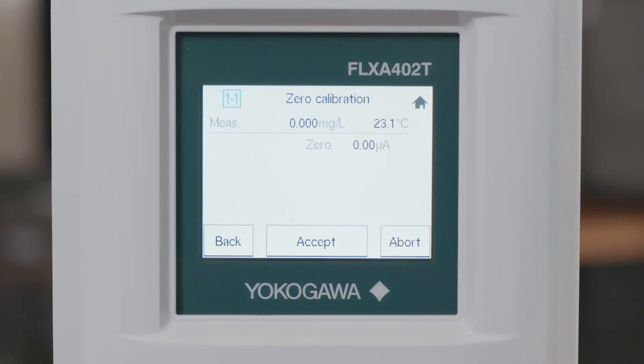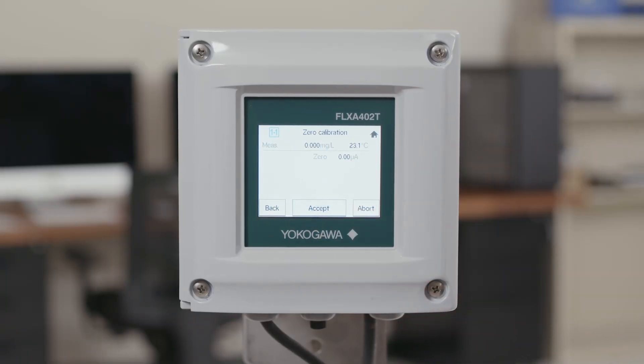On this screen you'll see back, accept, and abort. Back will take you to the previous step. Accept will accept the calibration and save it. If you don't hit accept it will not save the calibration. Hitting abort will go back to the calibration menu without saving anything. Once you hit accept your zero calibration is done and we can move on to a span calibration.